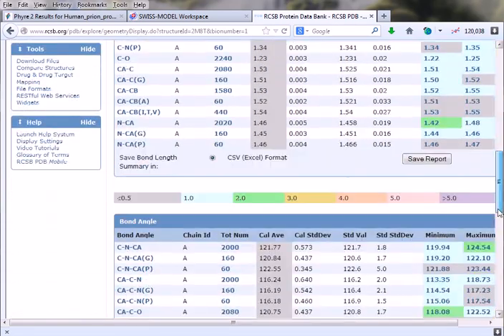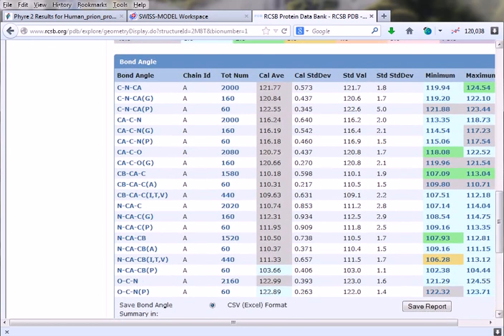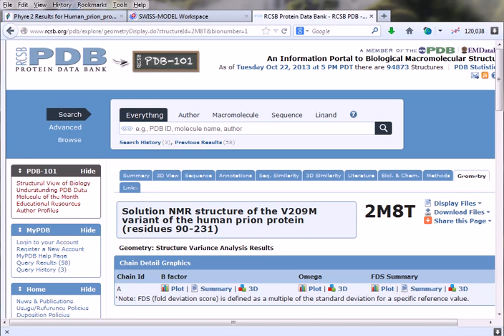This is a pretty hard time for us to understand this concept because we don't require them, because it is giving us different chains and the data coming from NMR. We don't require these things because we are at the pretty beginning, but we can search proteins like that depending upon what techniques they used for cracking the structure of the protein, and also depending upon the name of the author and also the type of protein and everything. So that's it, and I hope this video is helping you. Thank you.